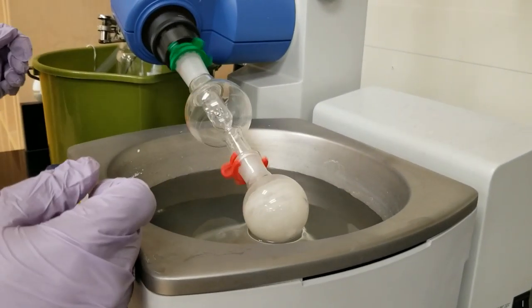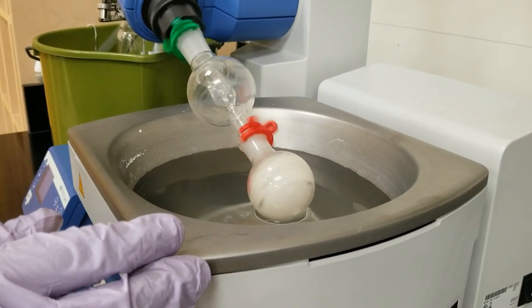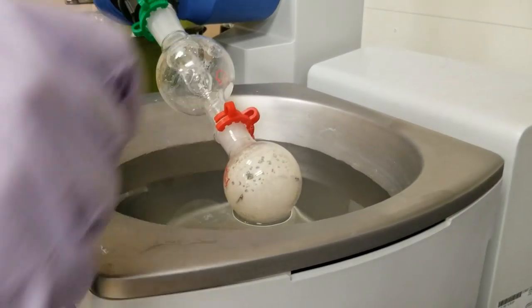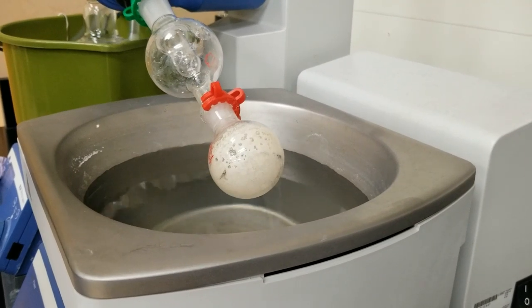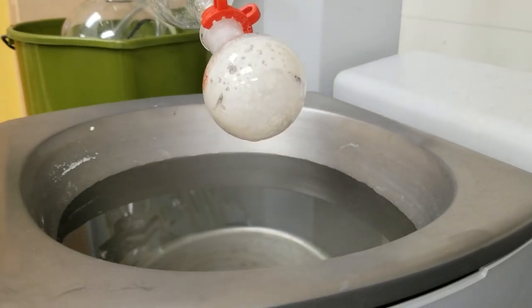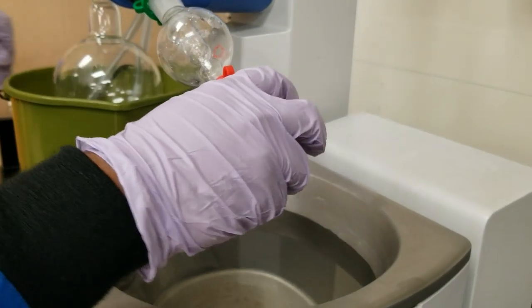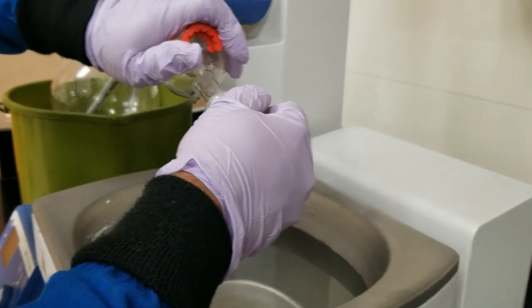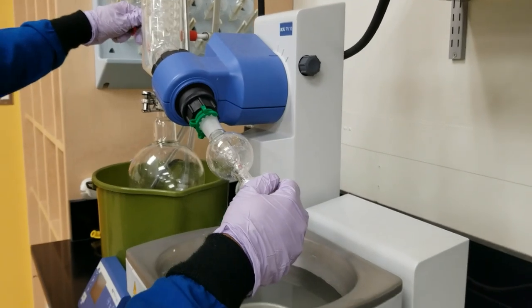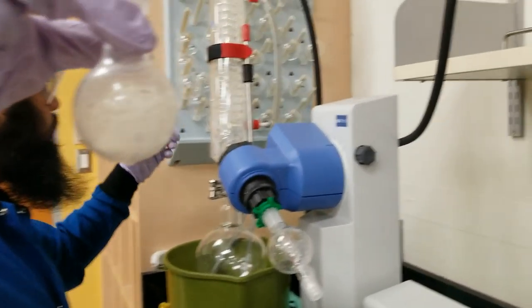So now we can see the white solid in the round bottom flask. So I might stop rotovapping. I turned off the rotation. As you can see, there's solid inside. I'm lifting this thing up, slowly turning the vac off and shutting down the whole machine. And taking it off. Oh, first we need to vent the air. And yeah, this is the acetanilide.